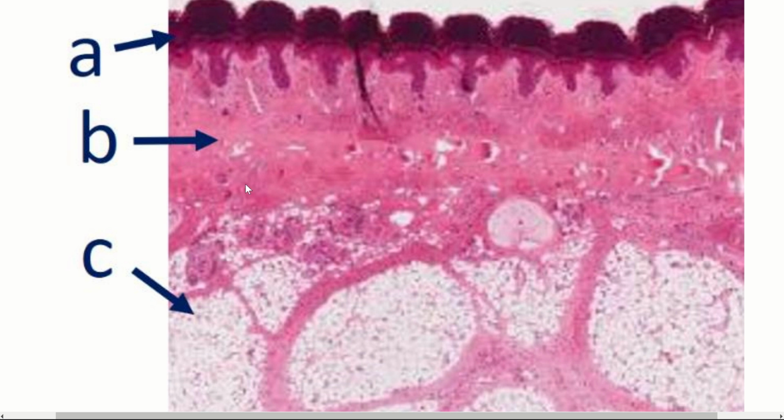Okay, and so remember B, this is in the dermis of your skin. This is where we have that dense, irregular connective tissue. This is where we have all those blood vessels and everything going on, right? So this is a site for metabolite exchange, because we have all these blood vessels supplying blood to the tissue around it, supplying blood to this epithelium out here. So there is a bunch of metabolite exchange in this section of connective tissue.